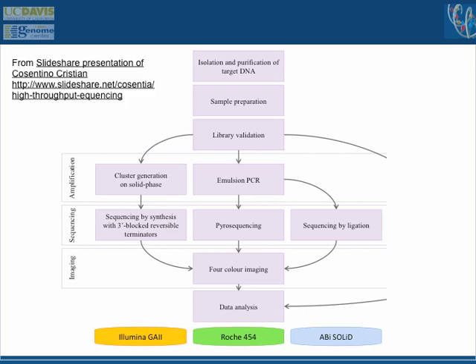And then when you run the reaction, you have to remember which position you are at when you run the sequencing cycling. You figure out base number 1, base number 2 by the coordinates of these clusters on the slide, and you identify where the clusters are by the first few cycles of the reaction.